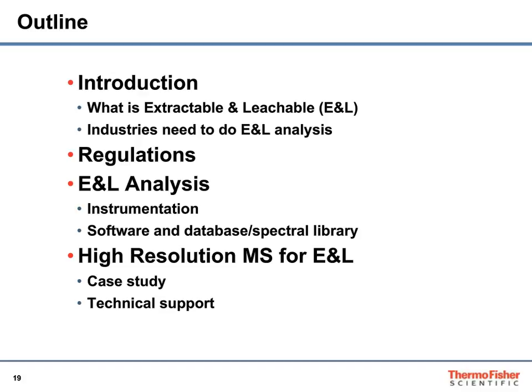The industry need to do the E&L analysis, and the current regulation, and also for the analysis itself, what kind of instrumentation, what kind of software and database spectral library are needed. Especially, I'm going to talk about high-resolution mass spec for extractable leachable analysis through a case study.